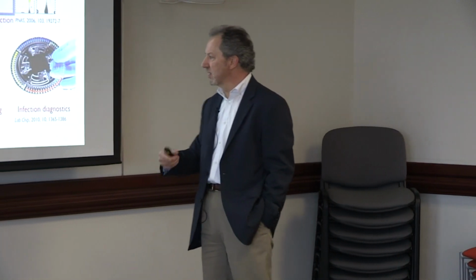What else is important? It's got to be rapid. And as we'll talk about today, portability is important, and automation. And these are just a couple of examples that are now old that talk about the type of things that people started doing on either glass or silicon or polymeric-based devices. So, cool stuff. I actually gave Mel a different title for the talk, and she chose not to use it. It was cool microfluidic blank, blank, blank. And this is one of the examples of cool stuff.